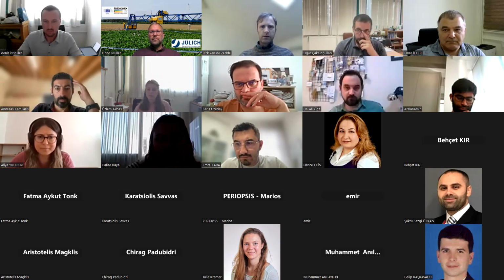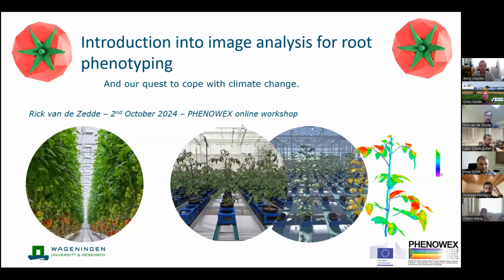Okay, start sharing. Just a bit of some introductional elements. So it is about image analysis, but I am also going to zoom in on the challenges of root phenotyping, because it's simply not an easy topic. And I will also explain a bit about the quest that we have been on to enable people to do all kinds of experiments, and often they are connected to measuring the effects of climate change on our food system, on our crops.